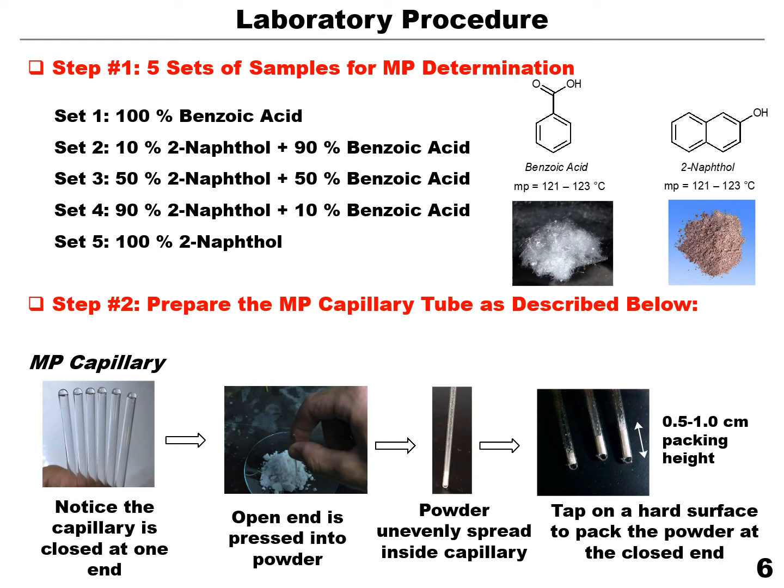If it is a very small sample, it might not stand to wait for the range. It may melt even before it reaches the range, because it will get the heat entirely, and it will end up melting.